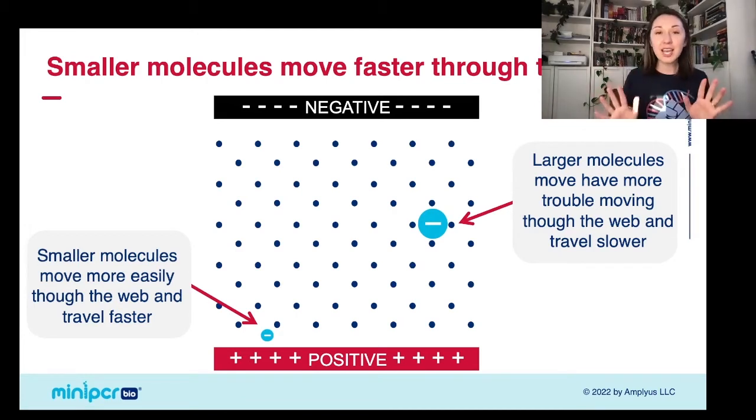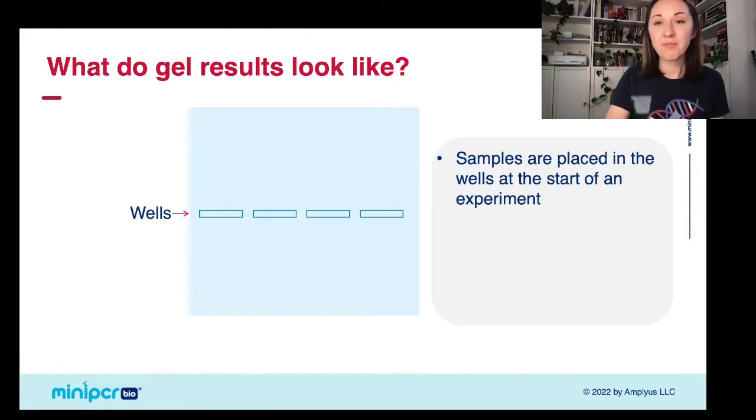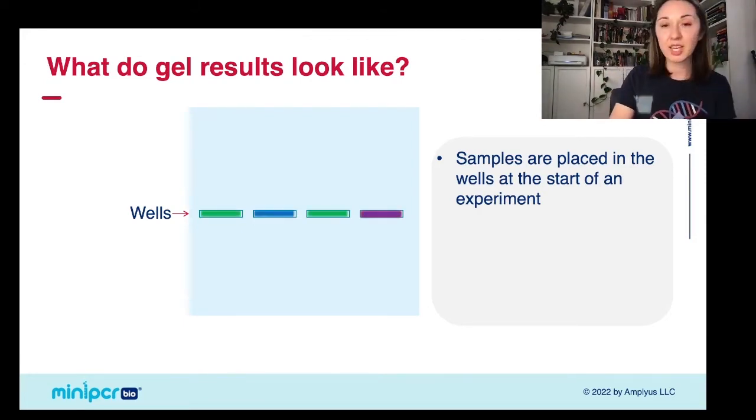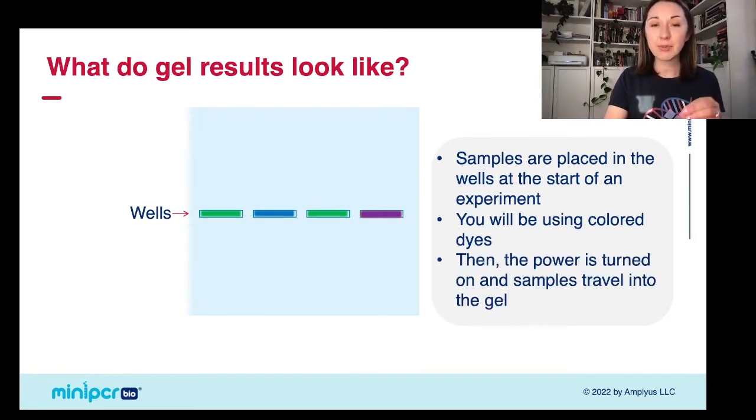So let's look at some mock gel results and see what we can tell from them. So again, your samples are going to be placed in those wells. And here we have a couple of different bands of just some made up colors. Again, we're going to be using colored dyes in our lab today. And we turn the power on, and the samples are going to be able to start traveling through that gel.